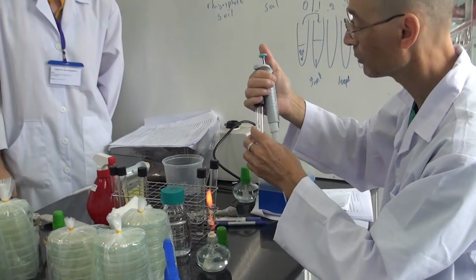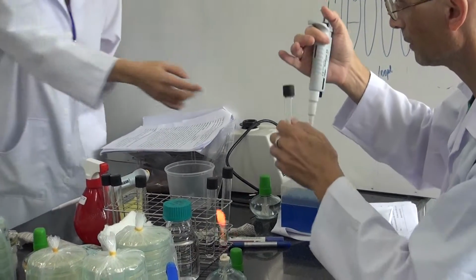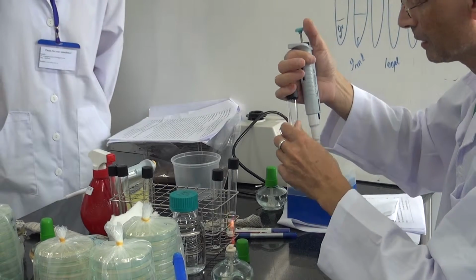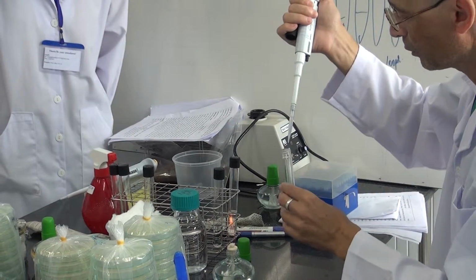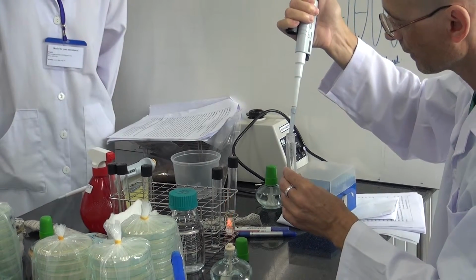Okay, otherwise it can jump, and then if it jumps, it will contaminate the filter. But let's do it on this one again. But when you go down all the way, first and second.